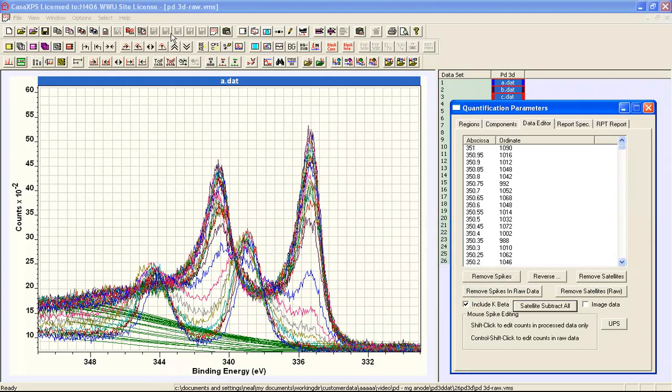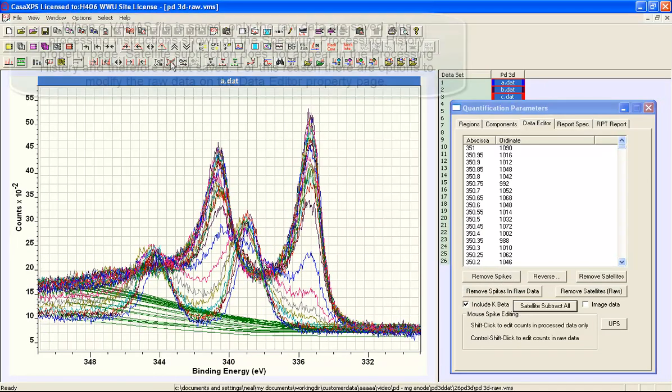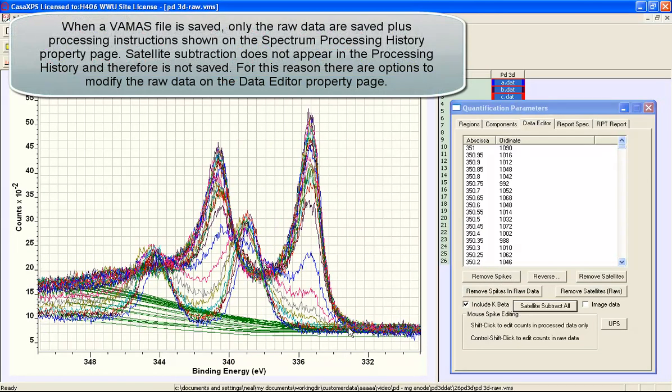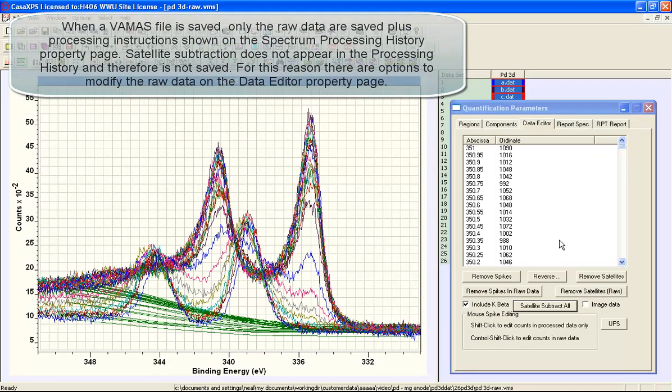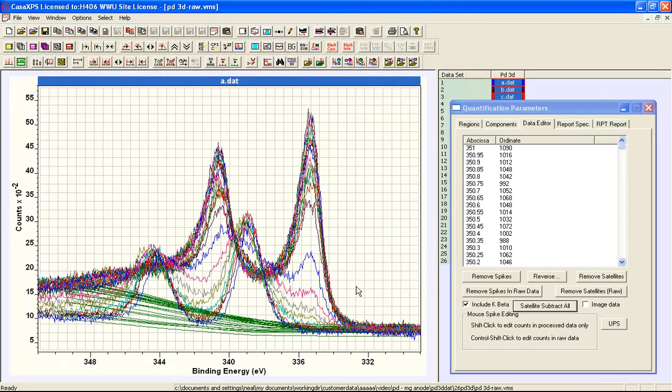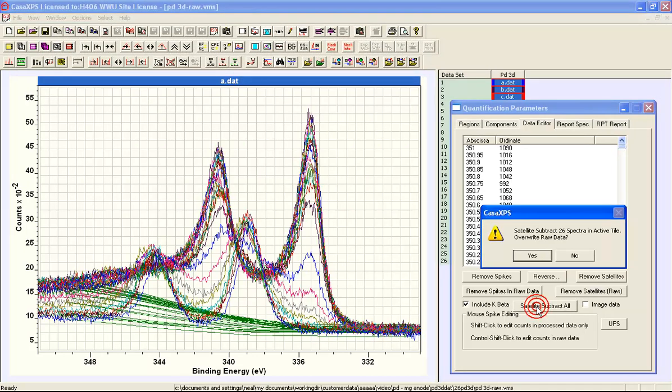You can see now that we have a set of spectra and the satellites have all been subtracted. So if I wish to retain this satellite subtraction I can perform the process again.